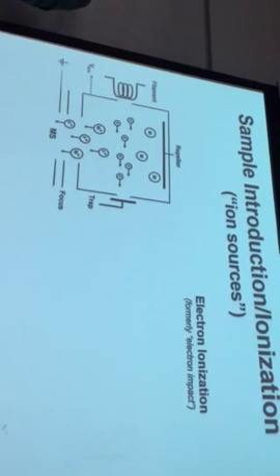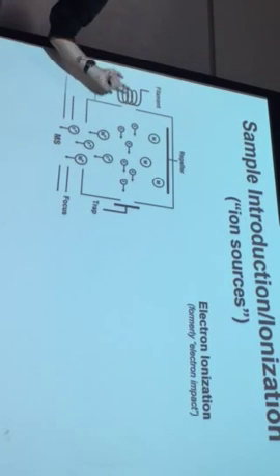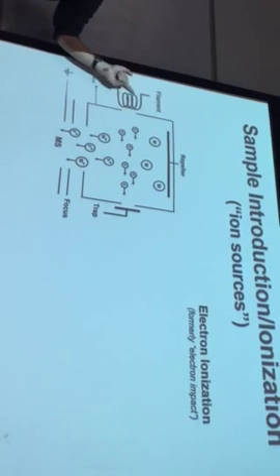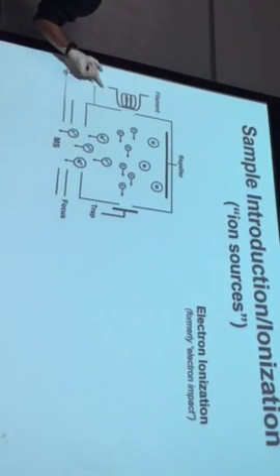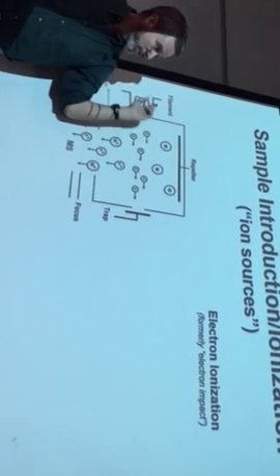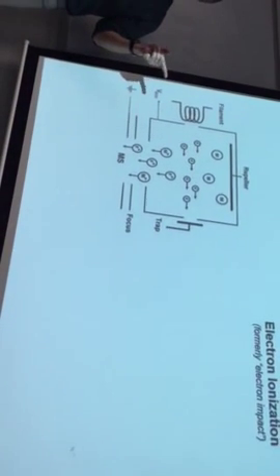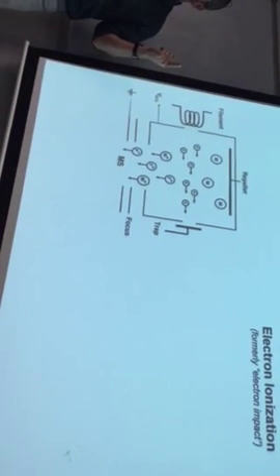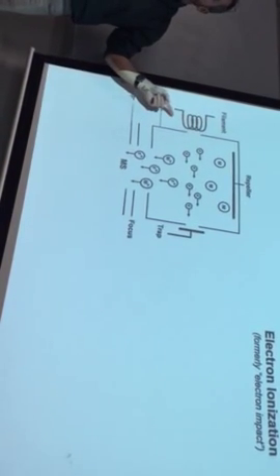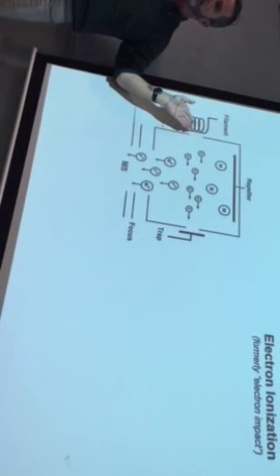Imagine that you can get your analyte up into the gas phase. So you have gas phase molecules. They encounter this high energy electron beam. You've got a stream of electrons generated by passing a relatively high current through a thin wire filament, right? Across the ionization zone is an electrode at a very high positive potential that will basically extract electrons flowing through this hot wire filament, generating that stream of electrons, going left to right in this image the way it's depicted.